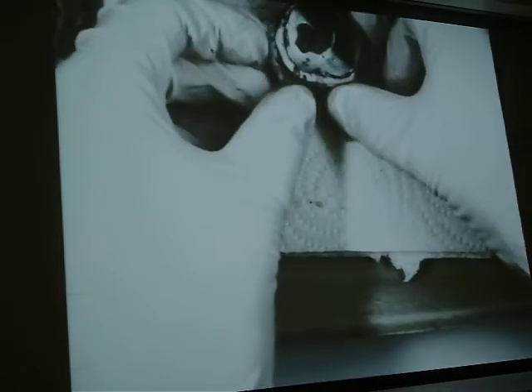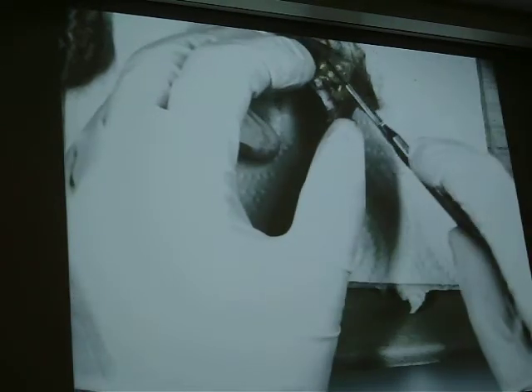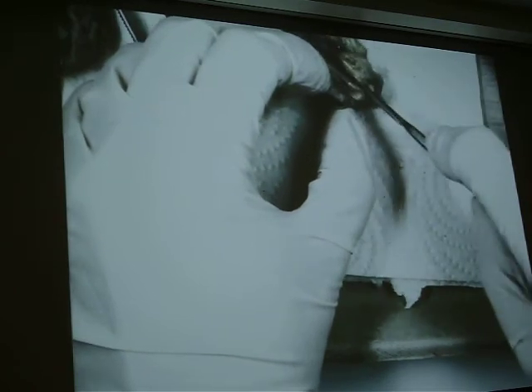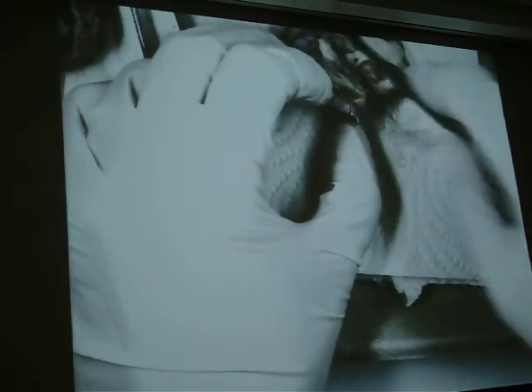Something else we can do at this point is find the optic nerve. It's way over there. I'm going to cut this a little bit shorter, closer to the back of the eyeball. I'm just getting a little extra tissue off there for them too. You can see it — that little round thing there, optic nerve.